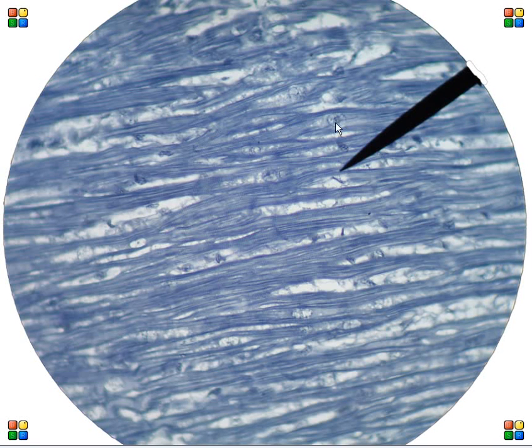More cardiac muscle, we can see the nuclei in this image, intercalated discs also. And again, different staining technique but the features are the same.